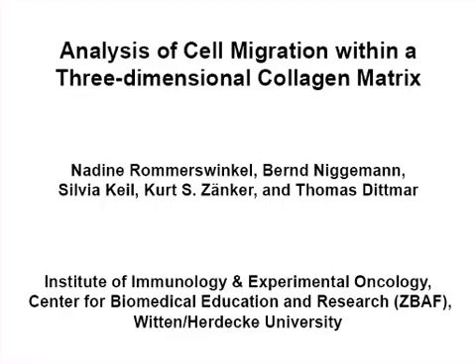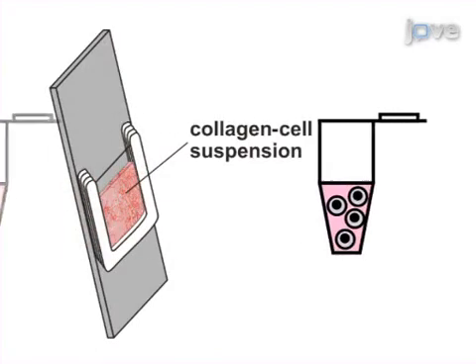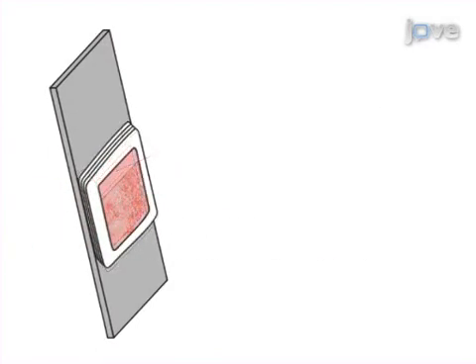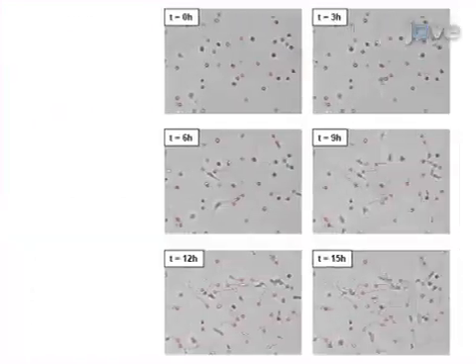The overall goal of this procedure is to analyze the migratory behavior of cells within a three-dimensional environment. First, embed the cells of interest into a three-dimensional collagen lattice, then record the movement of the cells by time-lapse video microscopy.